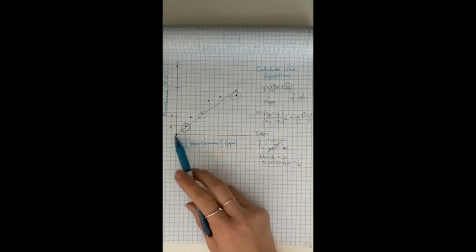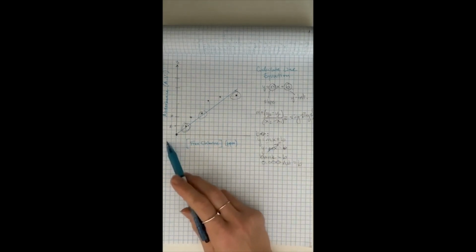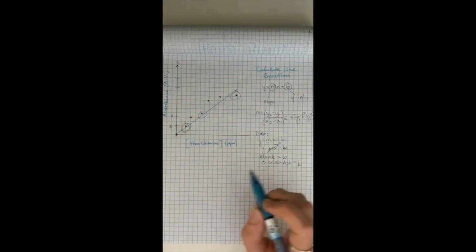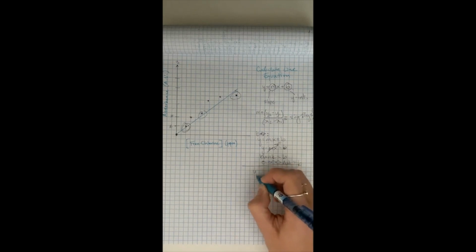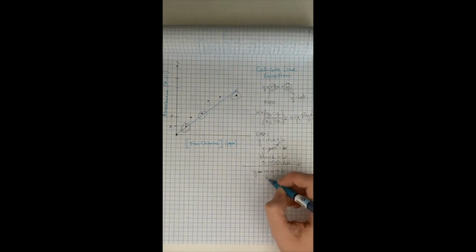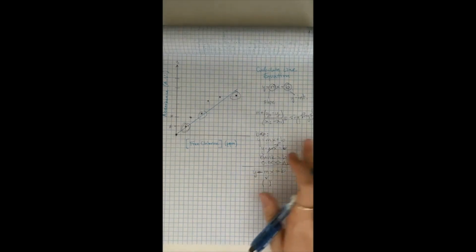What I didn't quite say correctly here is that you don't always have an actual x value that crosses at 0. So your y-intercept isn't always going to have that. And so what you can do is pick 2 other points and solve for what b would be also. I didn't do the best job of explaining that, so that's why I wanted to do this voiceover really quickly. I apologize, but there are plenty of videos out on the internet if this is confusing about how to find the y-intercept. So you can reach out for those or just reach out to your instructor and we can explain it better than I did here, so I apologize.